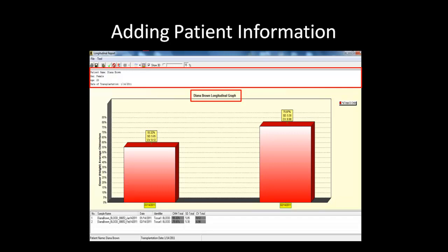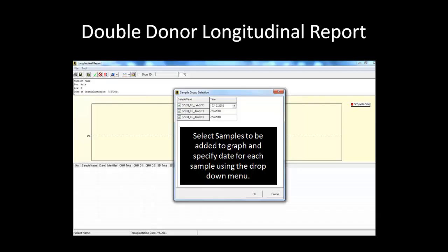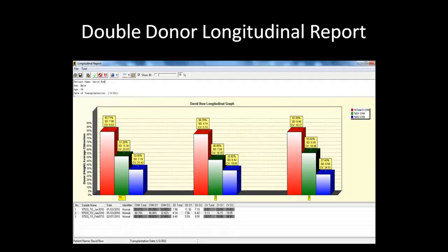Now we will move on to the double donor longitudinal report. Adding samples for a double donor analysis uses the same icon and method as previously discussed for single donor analysis. Once you have selected the desired samples, click OK to generate the graph. In the double donor graph, there will be three different colored bars representing chimerism for total donor, donor 1, and donor 2 fractions. The legend is located on the right side.